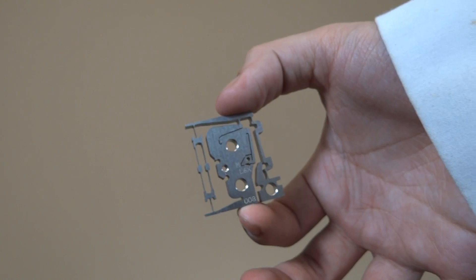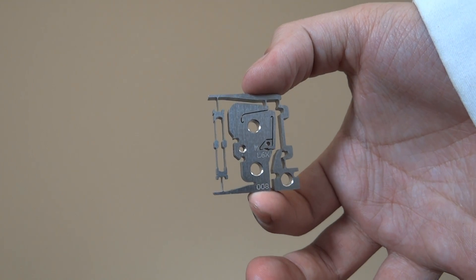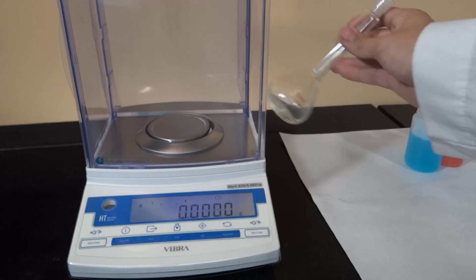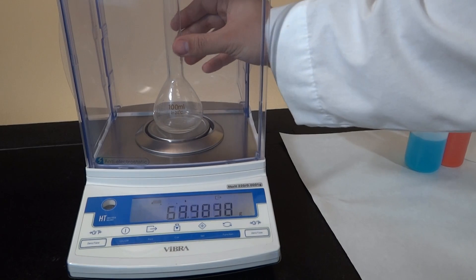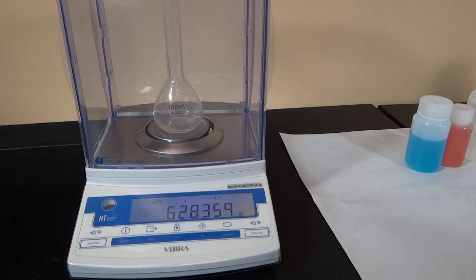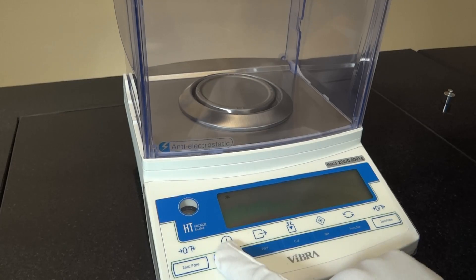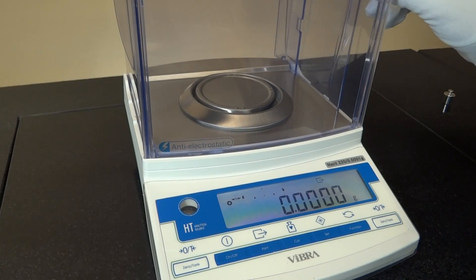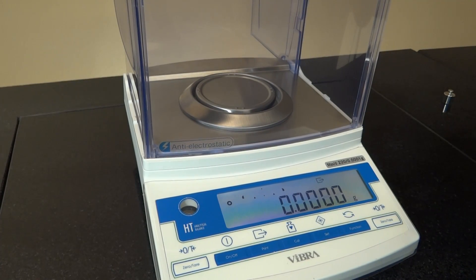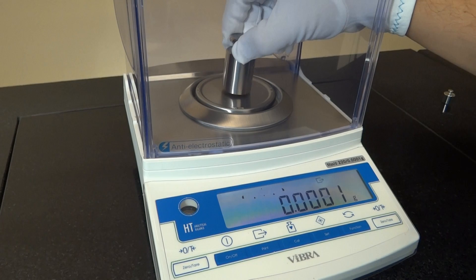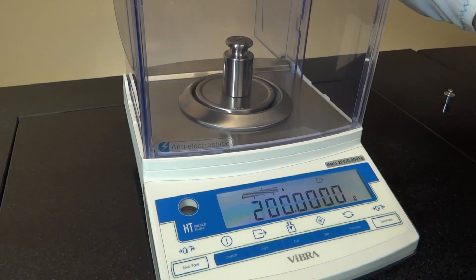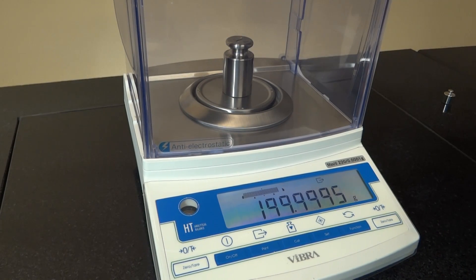Inside the HT is the Vibra tuning fork sensor. Protected and sealed by a steel casing, the tuning fork sensor offers the user many advantages. It is extremely stable and is unaffected by temperature during balance warm-up, meaning the HT will provide its maximum performance and minimal drift immediately after turning on. There is no warm-up period.